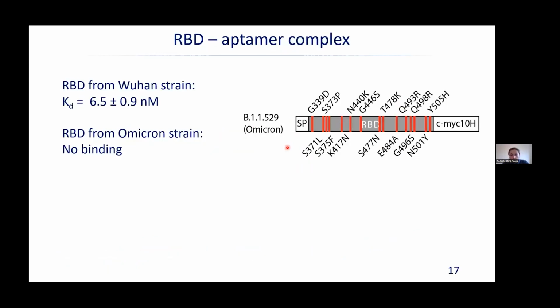So then we chemically synthesized this aptamer and checked its dissociation constant with the RBD domain of the SARS-CoV-2 virus.